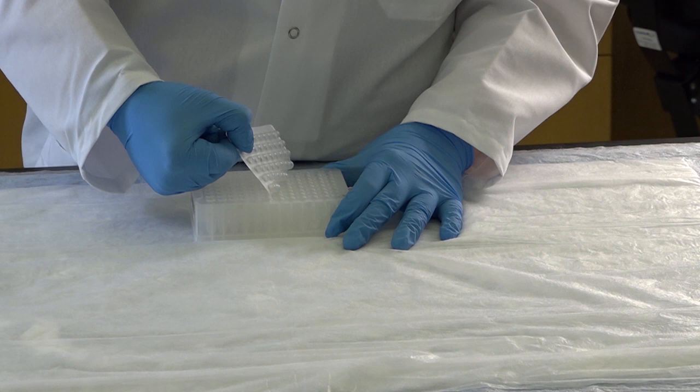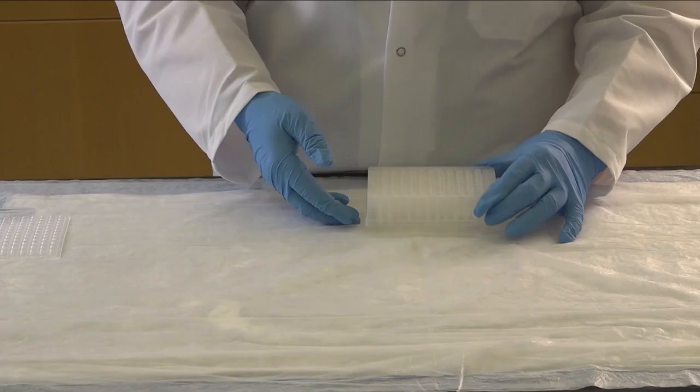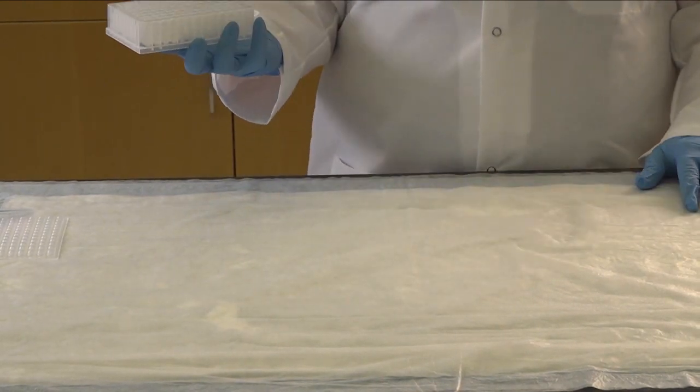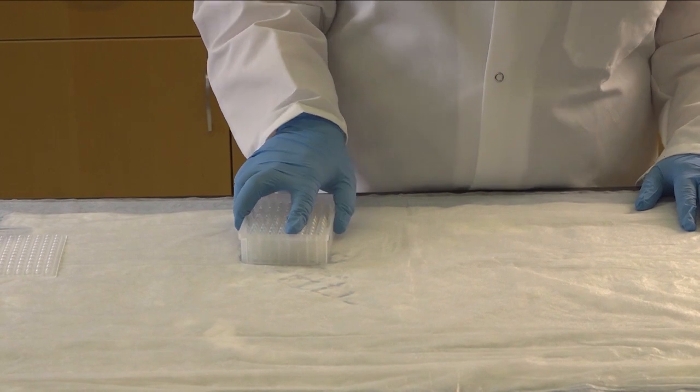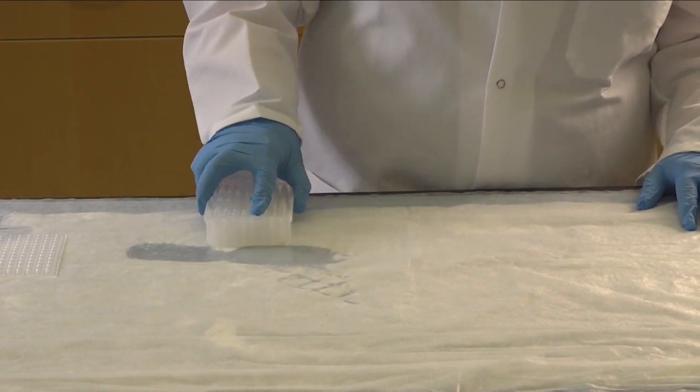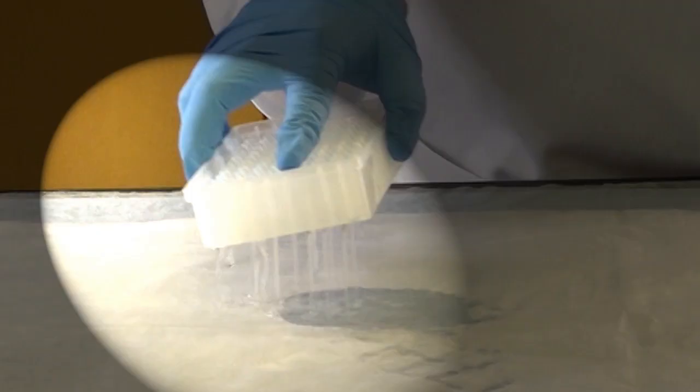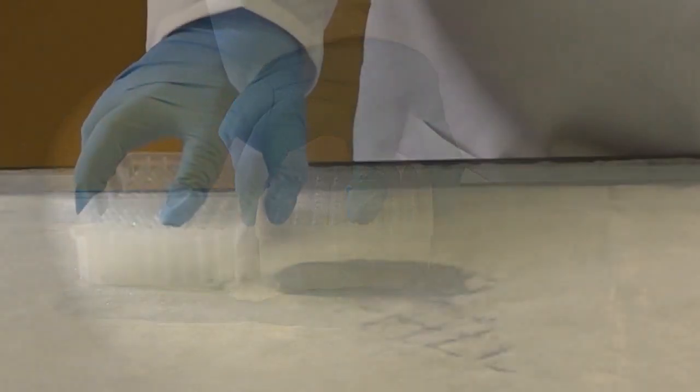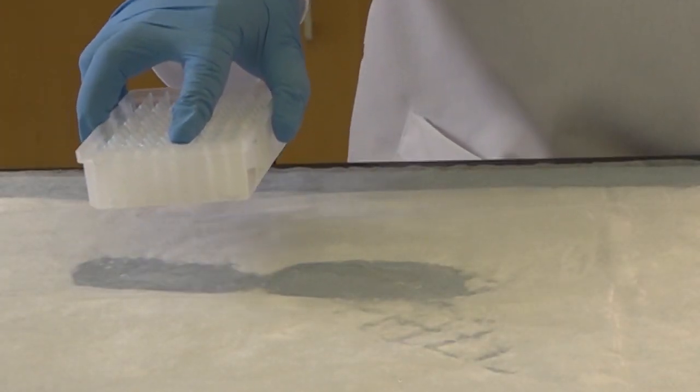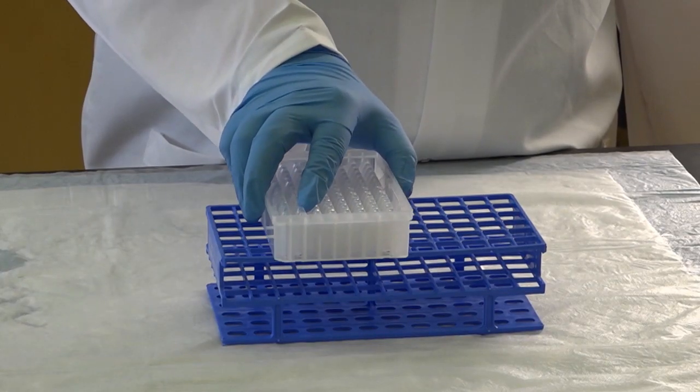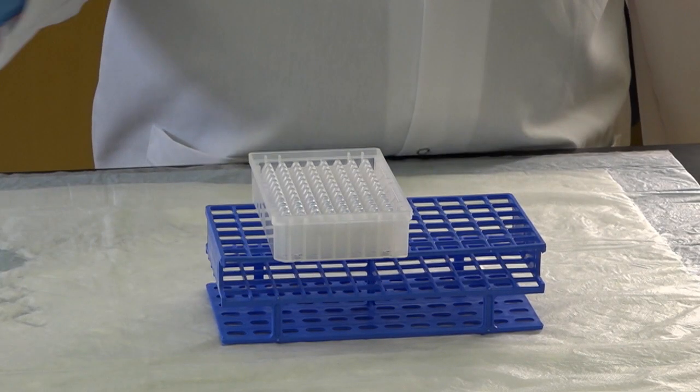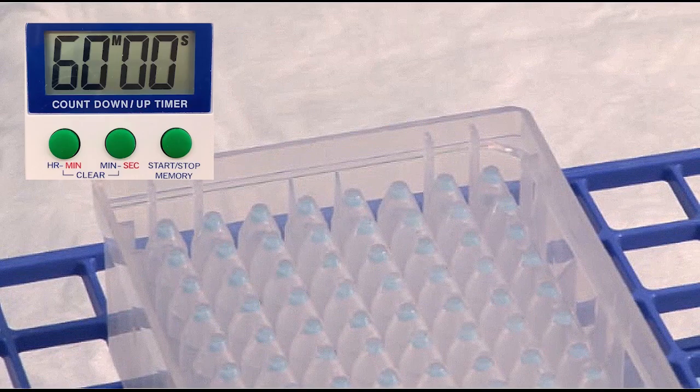To decant the supernatant, first remove the cap mat from the plate. Then, quickly and firmly invert the plate onto the absorbent bench pad in a straight up and down motion. Lift the plate straight up, allowing the supernatant to drain without entering other wells. Firmly tap the plate around the dry areas of the absorbent pad for one minute. Place the plate face down atop a tube rack. Leave to dry for one hour.